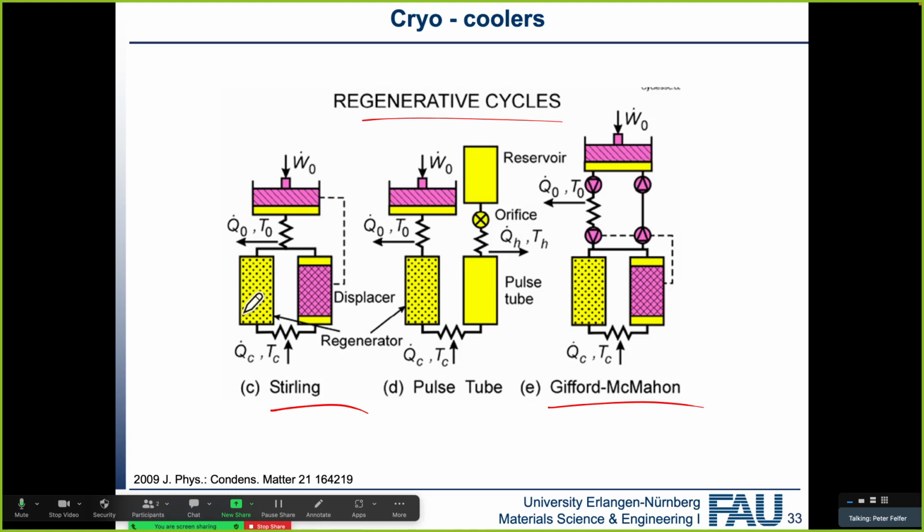So they can just go and get some liquid helium from the helium liquefier, which the university owns, a relatively big one actually. So we can make our own liquid helium, and then you can cool that way, which means you don't have this awful sound and you don't have the vibrations that are caused by this.